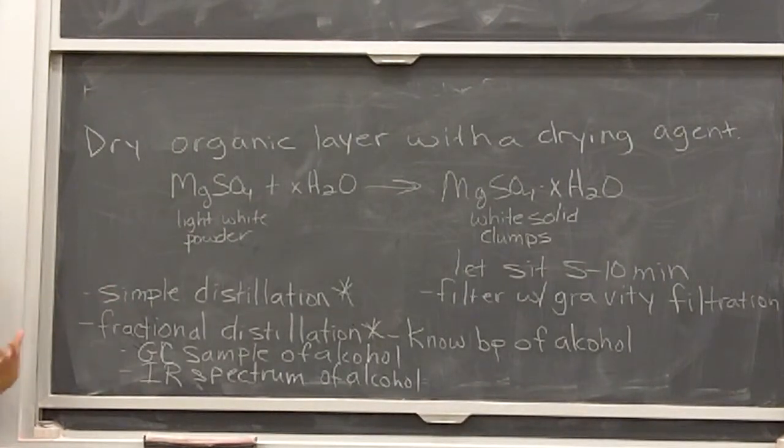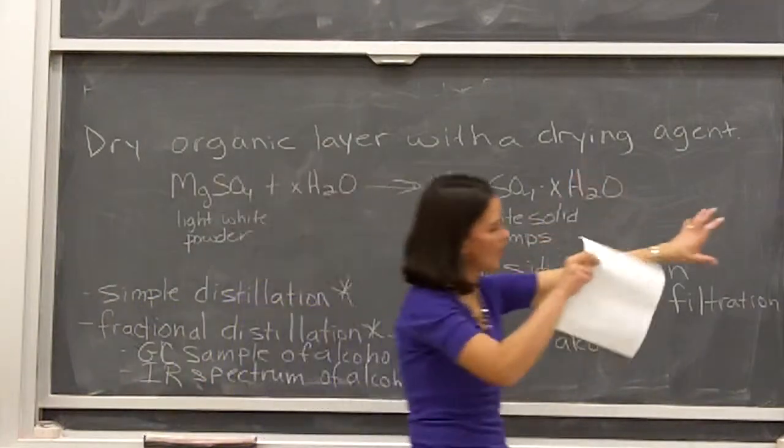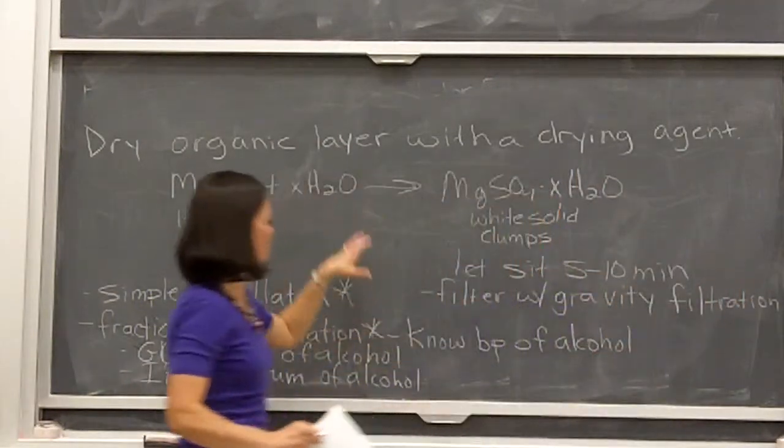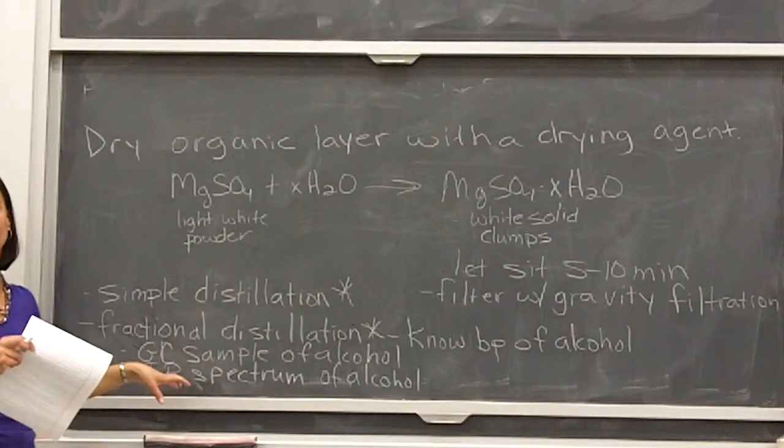And remember, be really careful with your product from this week. You need it for next week, so don't throw it away. So when you're doing all of these, the workup, all of your different layers, you're doing the distillation, hang on to everything till you know you have what you're supposed to have.